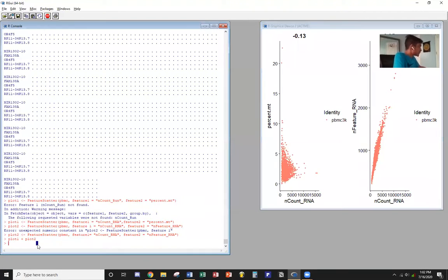Next, we'll just be continuing on with the guide, pbmc subset. I'll be writing lines of code and then I'll explain them right after. So, equals nFeature_RNA greater than 200 and ampersand. So there it is, ampersand nFeature_RNA.